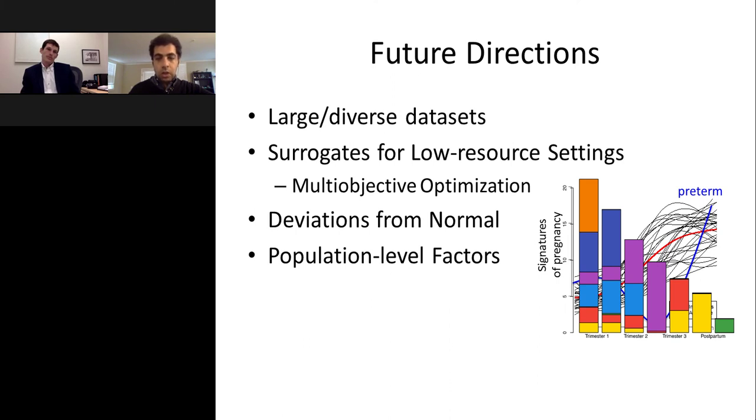Here on the y-axis, again, we have minus log 10 of p-value. In the first bar, we have the full model that we've been talking about for gestational age. In the second bar, I'm excluding our most important data set, the orange one. And what you can see is that the model can retune itself to compensate for some of the lost predictor. So these other data sets can be combined in various ways to compensate for a missing data set. This helps us answer more complex questions in a resource poor setting.